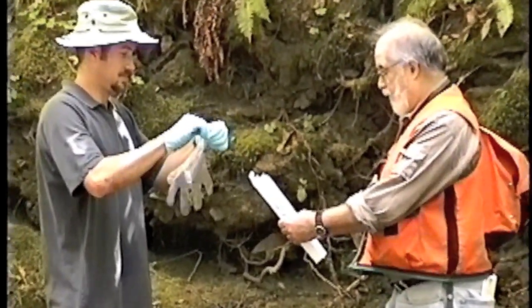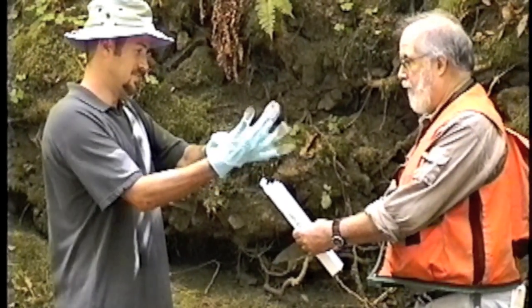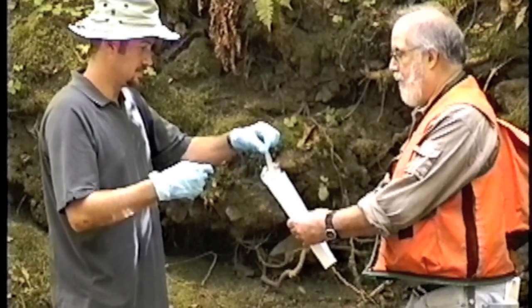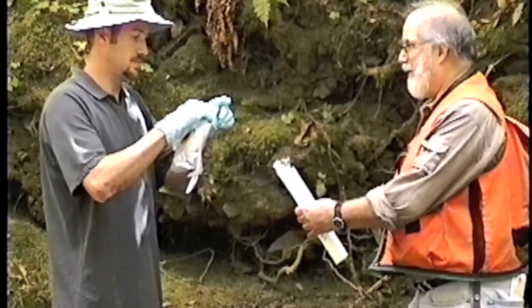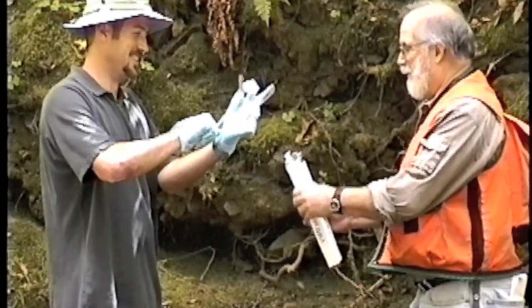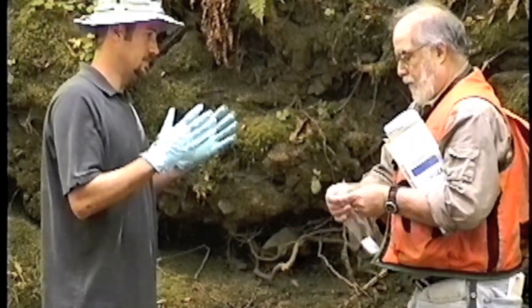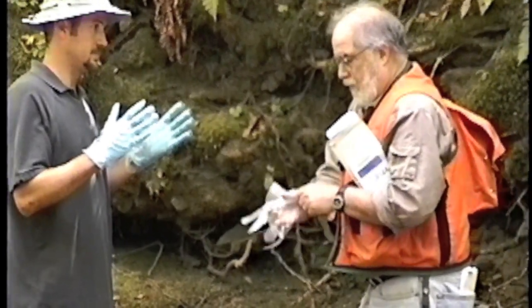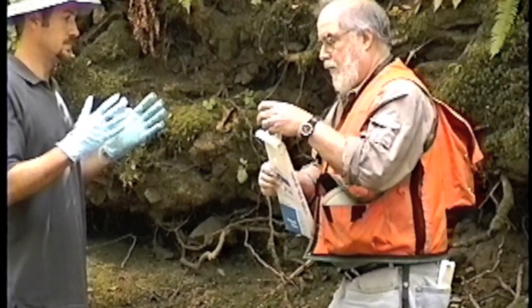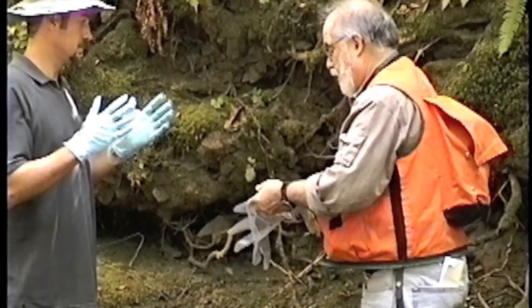Sean is going to be clean hands and he is going to put another pair of polyethylene gloves on his other gloves, and he will not be touching anything except the sample bottle that is being pre-cleaned. It is a very complex procedure. Peter is going to be dirty hands; he is going to touch the outer bag that holds the sample bottle, but he is going to put poly gloves on his hands as well before the procedure starts.